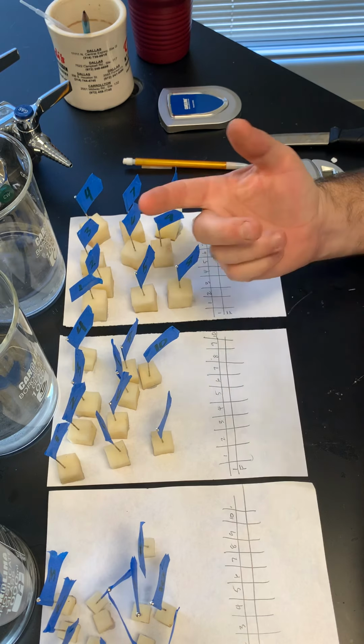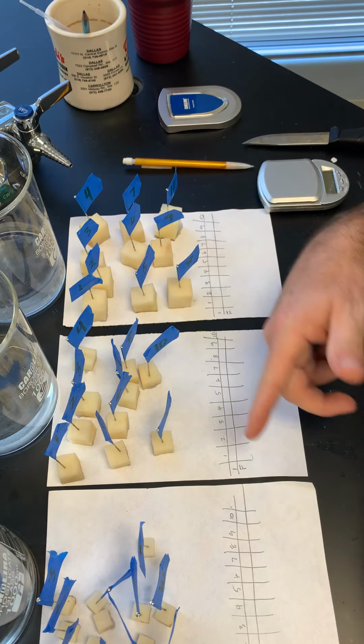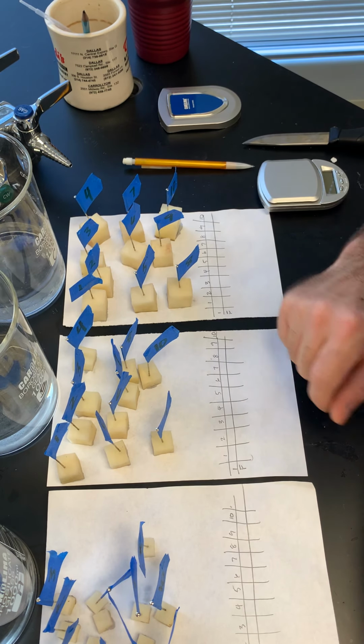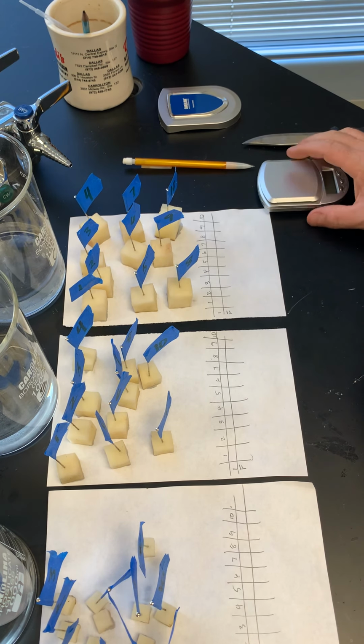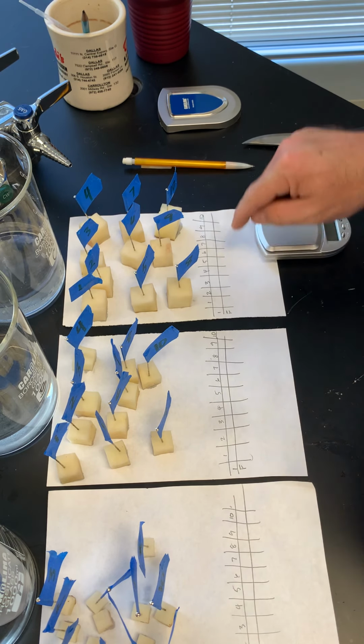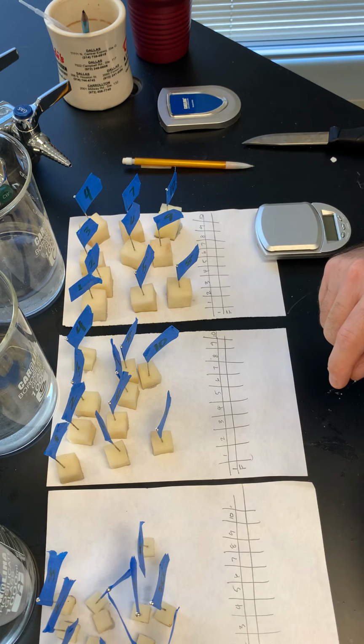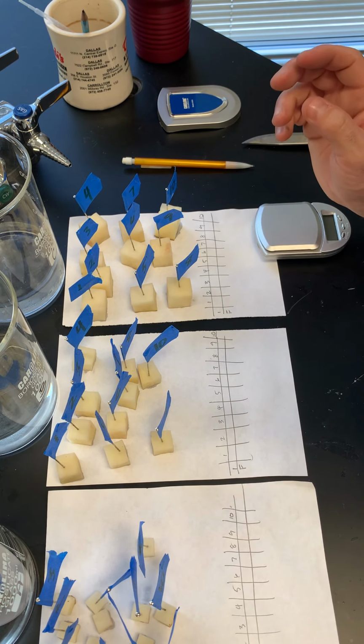So I recommend you guys either use solute concentration, which is what most people do, or if you really want to get adventurous, you could do surface area to volume ratios. And so that's what I'm going to do. I'm going to let you guys watch me take data. I'm going to write it down, and then I'll transfer it over to a computer. Well, I'll pause the video, and then I'll wait 1 hour, and then I'll come take data.